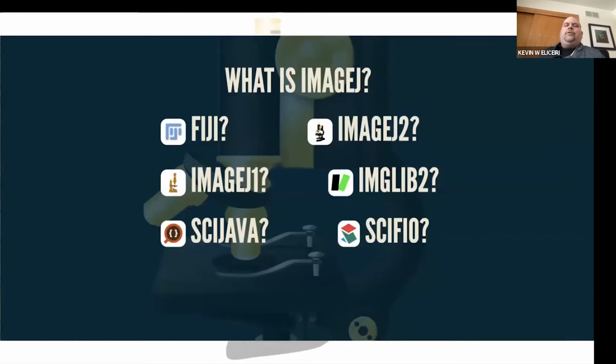So when you think about ImageJ, it's been around for a long, long time, right? I wrote a review with Wayne Rasband, the original author at NIH, and it's incredible to see its original roots as NIH Image in 1989 all the way to now. And actually recently, Nature picked NIH Image/ImageJ as one of the top 10 impactful software or computational stories ever, which is pretty amazing if you consider all the great things that have happened in science and computation. To choose ImageJ and NIH Image is really a testament to how impactful it's been.